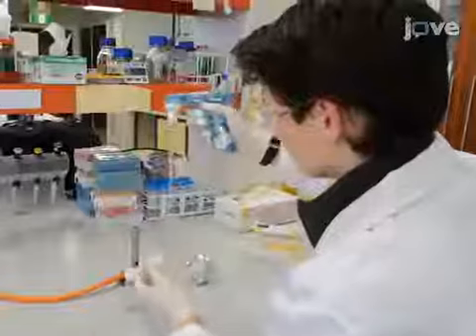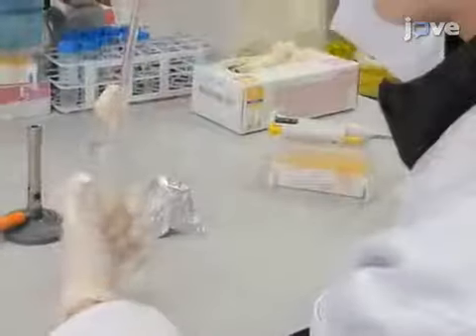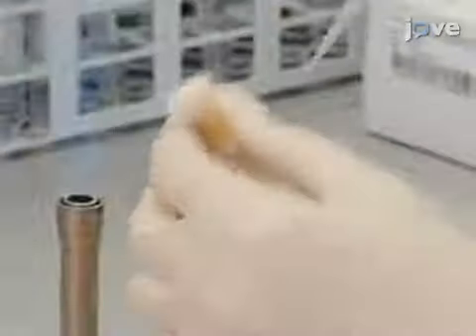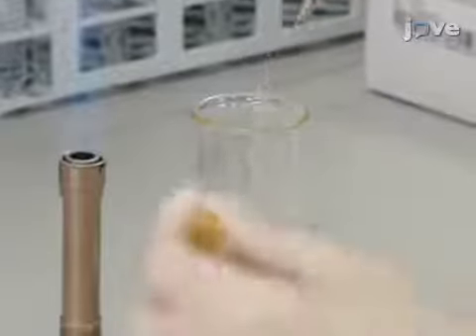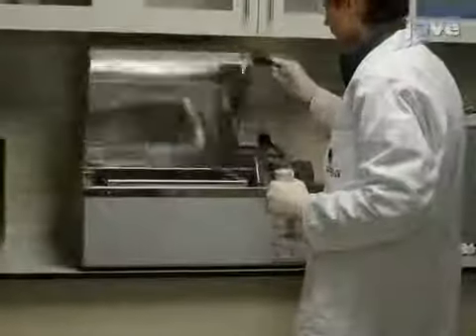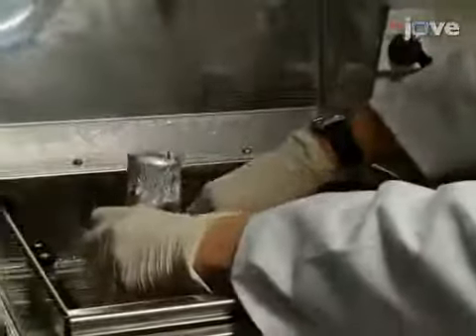Remove a 10 mL sample to serve as the uninduced control. Add 0.1% arabinose to the remaining culture to induce the production of TETRYFP from PKM1. Continue to grow both the uninduced and induced cultures at 30 degrees Celsius with shaking.